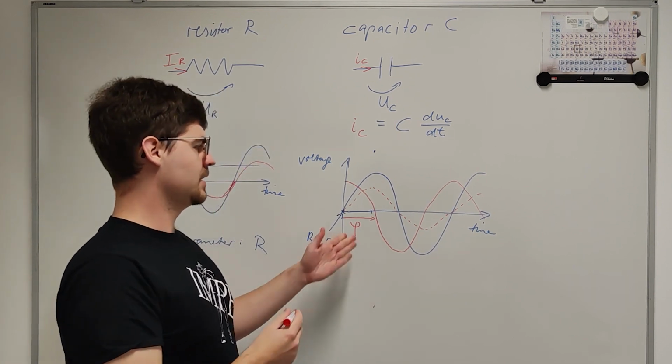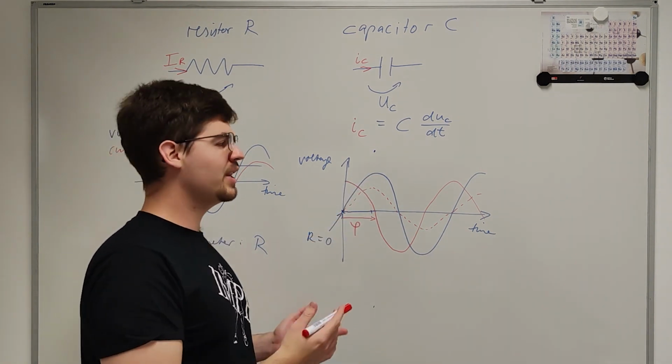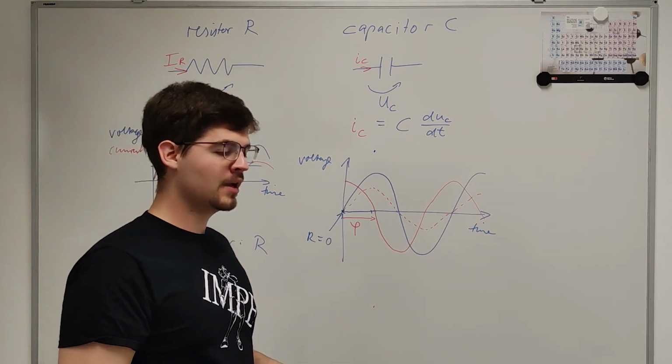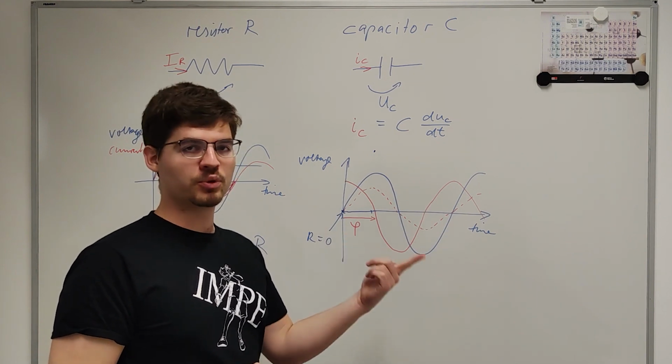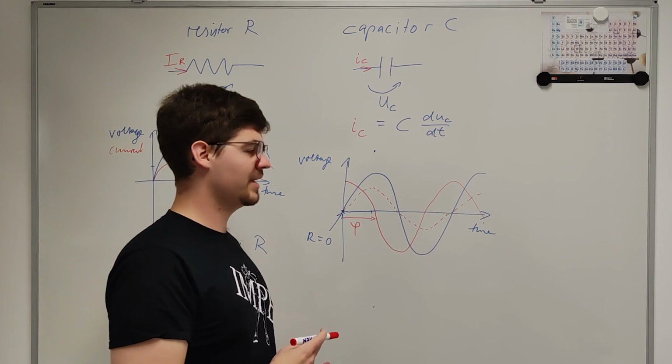And here we shift it by 90 degrees, and we again obtain a description of the system where we now can form a time constant quotient of the two. And we can describe this current response fully, now not with one, but with two parameters. And this kind of description we are calling impedance.